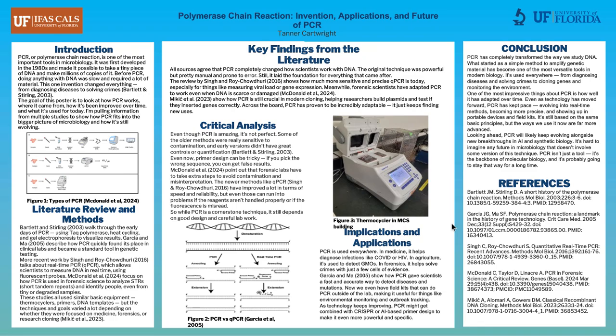So yeah, there's a lot of avenues to improve PCR, making real-time PCR more simplistic. There's many companies that will put all their reagents together, the primers and all that sort of stuff, to simplify as much as possible. Even though it's already really a simple method of just increasing and decreasing the temperature with the right ingredients in the tube.